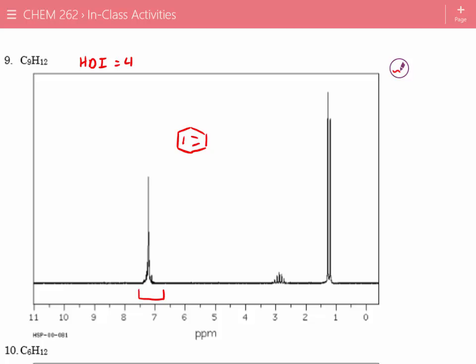In this case, the benzene peaks all in this aromatic region look like they're pretty clumped together. Usually when you see this splitting pattern, it means that either you've only got one substituent or you don't have very good symmetry. So in this case, we're missing 3 carbons coming off of it. So let's say we're maybe missing this guy.